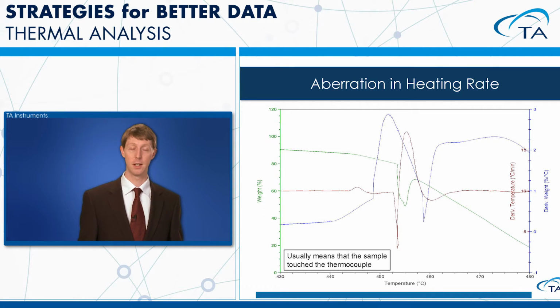But again, if you don't want to spend too much time analyzing these data sets, assuming that there's something either wrong with the instrument or something wrong with the material, it may be telling you exactly what the material is doing. You just have to look at it from a different perspective.